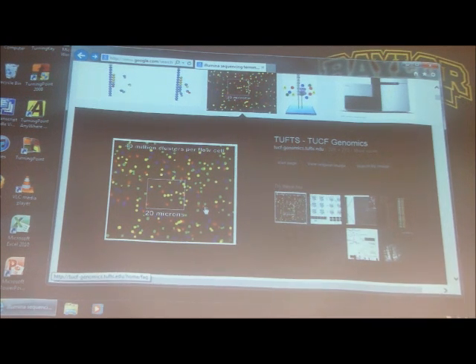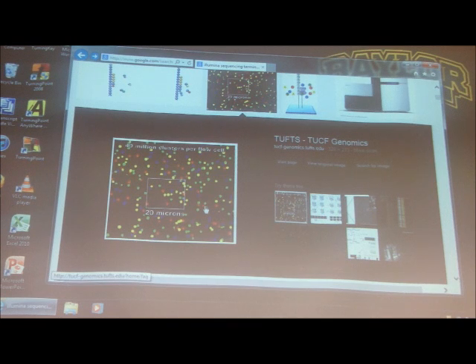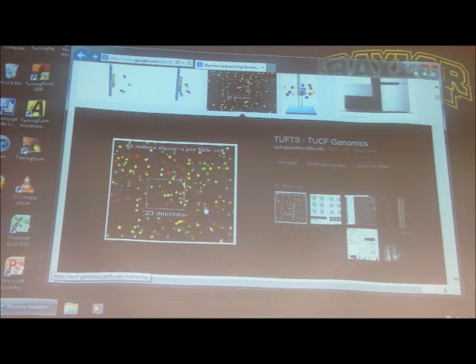You know what? We've run out of time, so we'll just stop at 454 pyrosequencing and the Illumina sequencing. We won't go over SOLiD and Ion Torrent. You can look at those if you want to, but I won't put those on the test because we've run out of time. Okay?